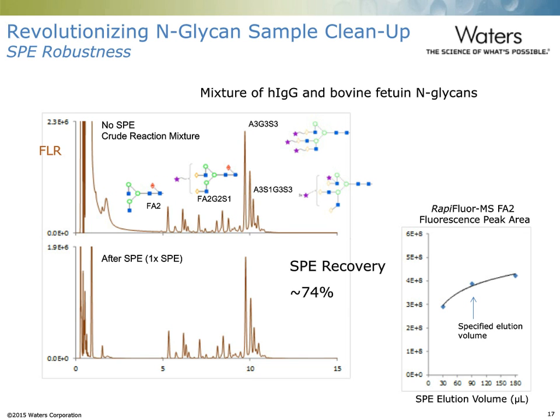And what we've determined is that with a 3 by 30 microliter water elution off of our SPE, we can get about 75% recovery, and that still gives us a high enough concentration of sample that we can directly analyze that. More water washes would lead to a higher recovery, but we thought that this was a good compromise in terms of analysis efficiency.